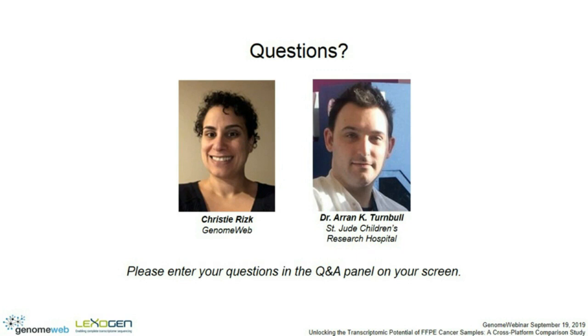Can you talk a bit about detecting alternative splicing events in FFPE samples? Actually, probably not. That's something we haven't yet looked at. It's something we are interested in going forward to do, but it's not something that we have looked at yet. So our full RNA sequencing data that we generated is relatively new, and we haven't really got to grips with the analysis of that yet. So it's not something we've done, but it's something we're going on to do next.